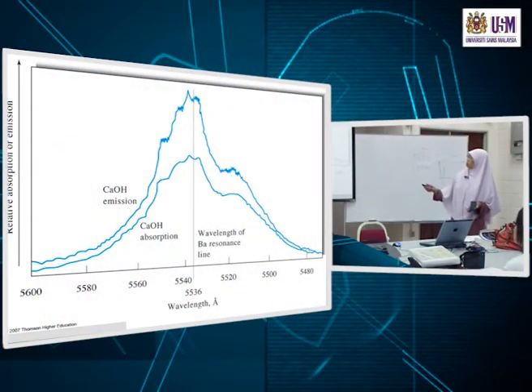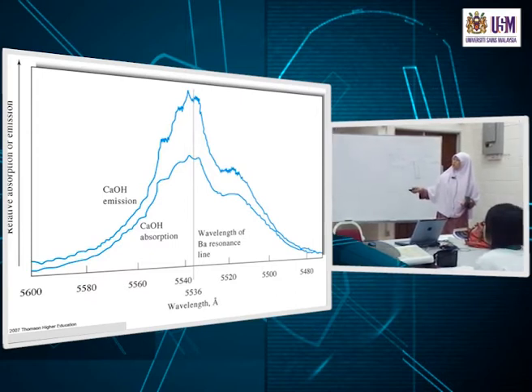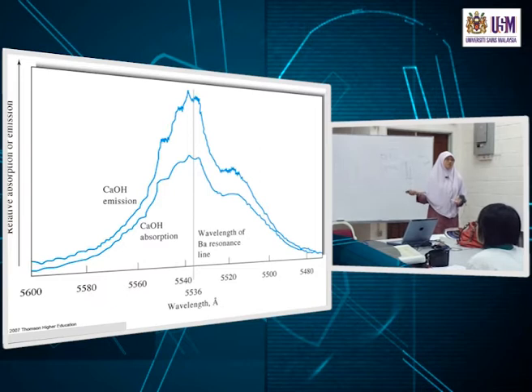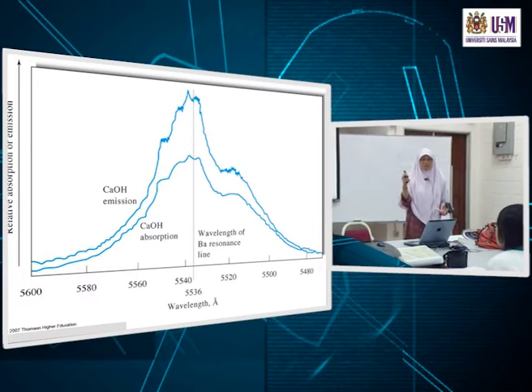Here, what is shown is a spectrum. Remember, when we mention spectrum, it must be how something varies with respect to wavelength, so the bottom here is wavelength. You can see it as either absorption or emission. Emission is the intensity of light, which changes. Absorption means it is A. Remember, A is related to log P0 over P.